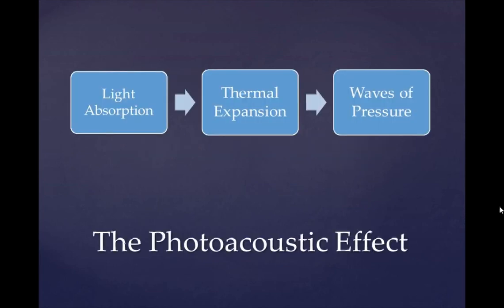The photoacoustic effect is a photothermal effect that involves a substance absorbing modulated radiation and then releasing that energy to make a sound. When a substance absorbs radiation, its molecules will expand. Subsequently, its molecules will release their energy thermally by contracting. The resulting pressure differential makes sound waves.